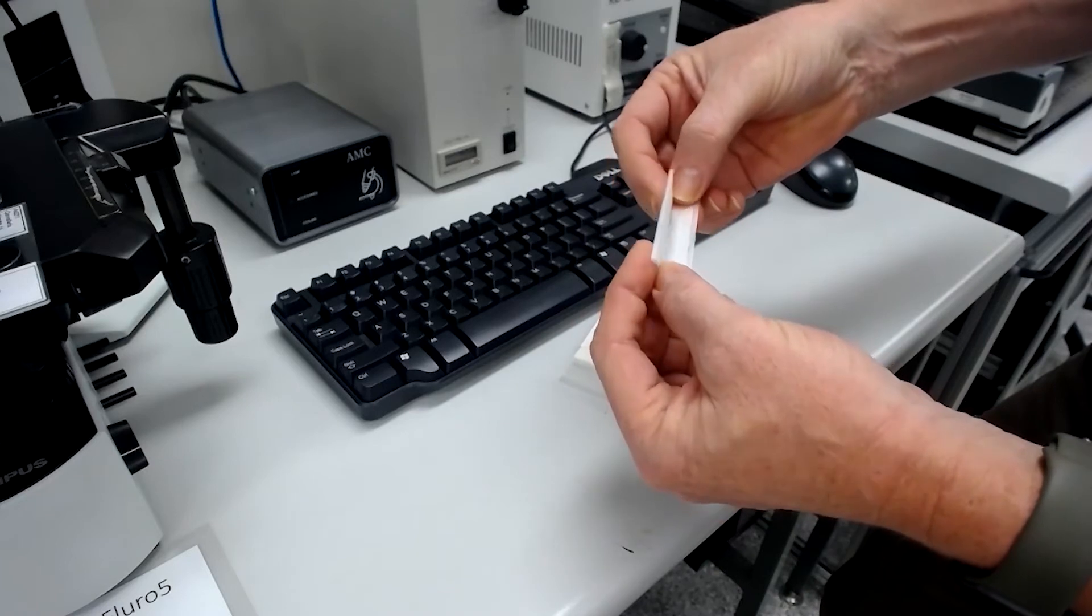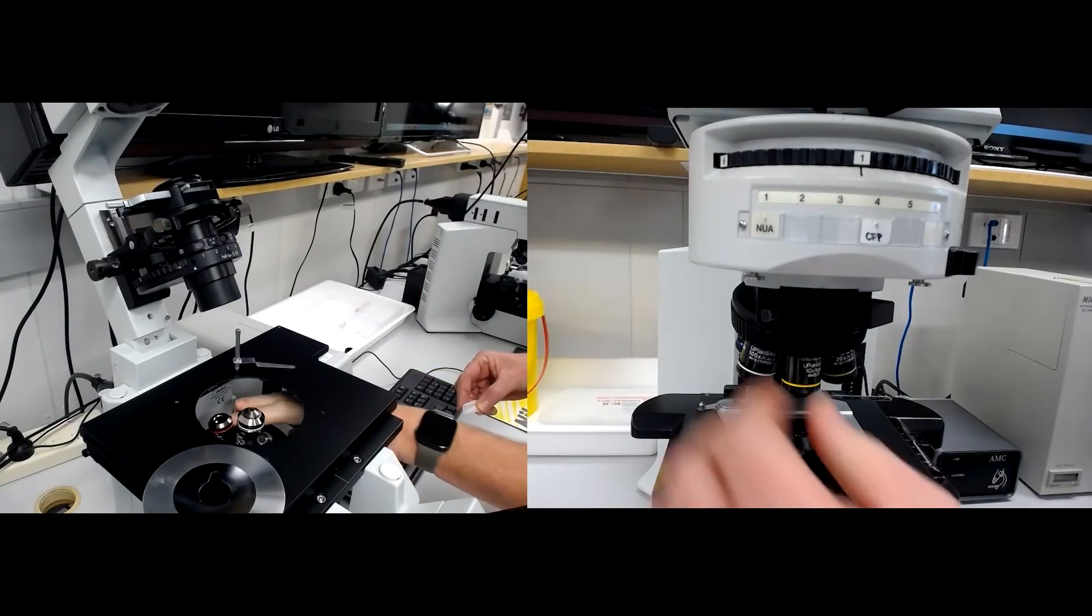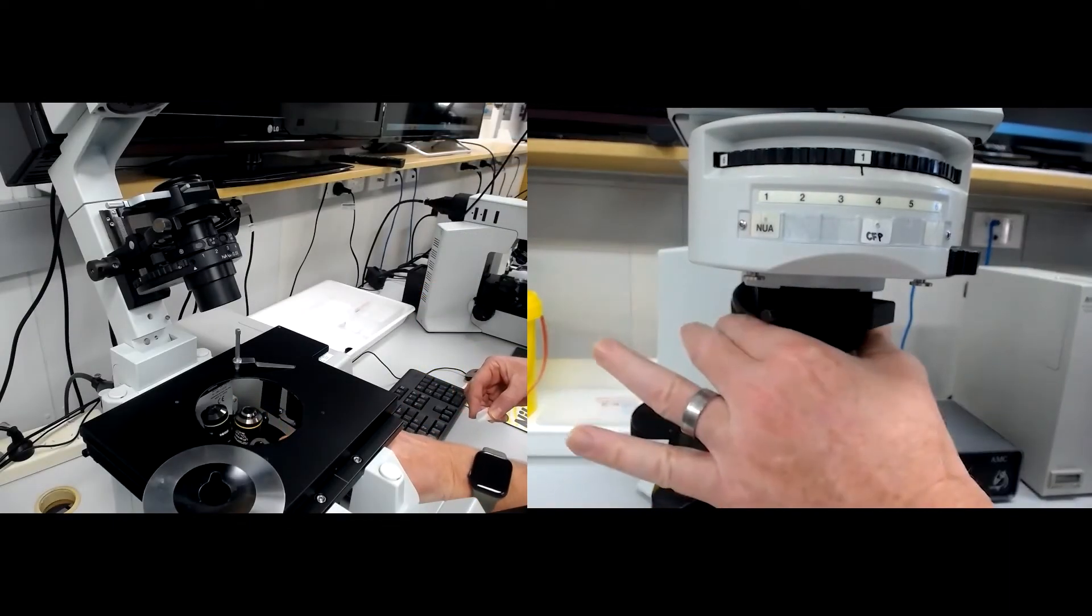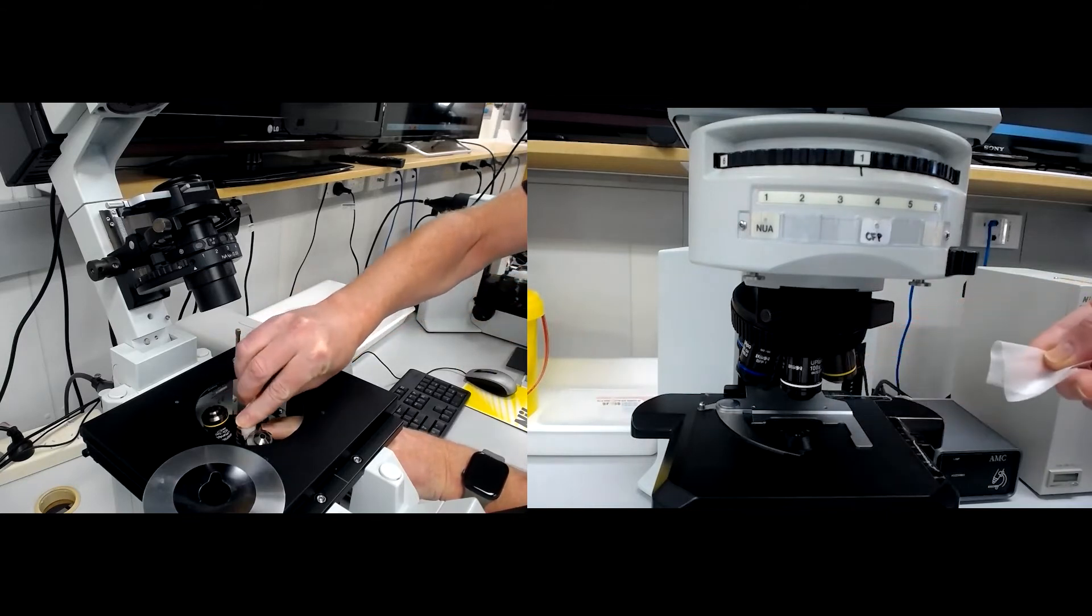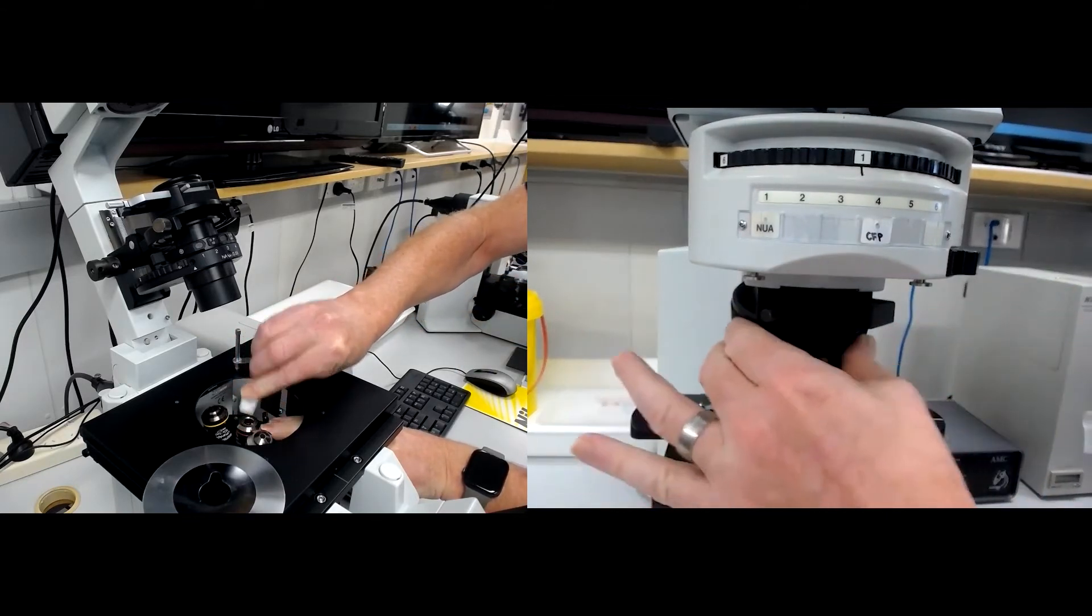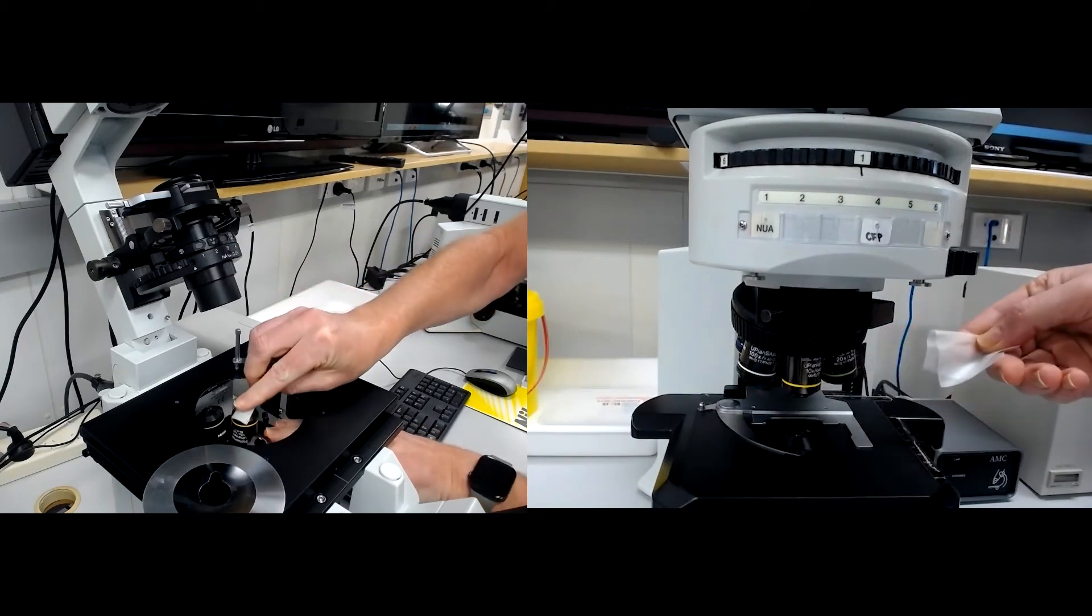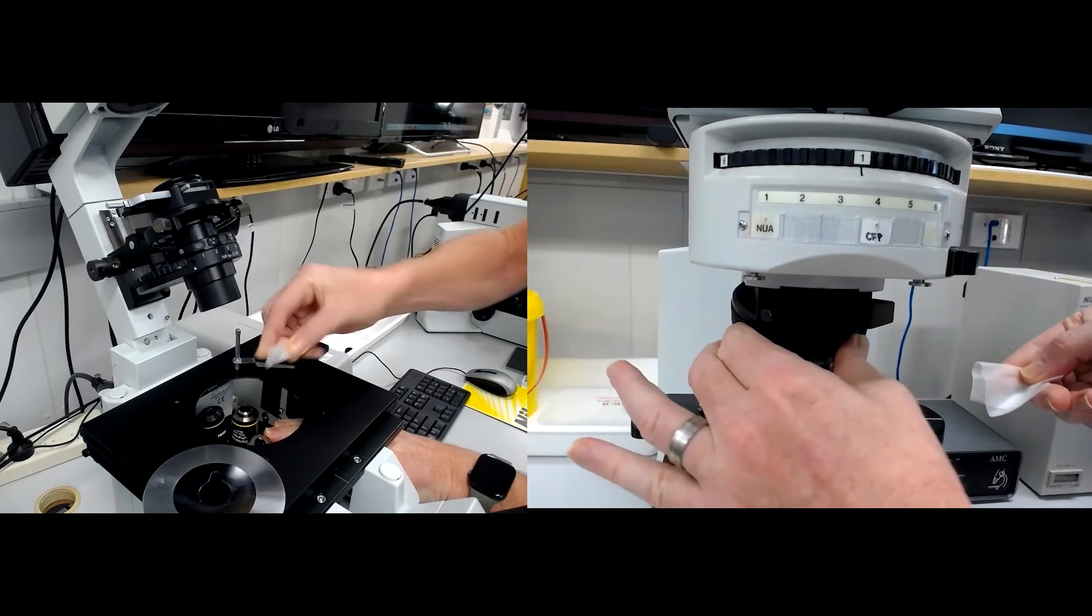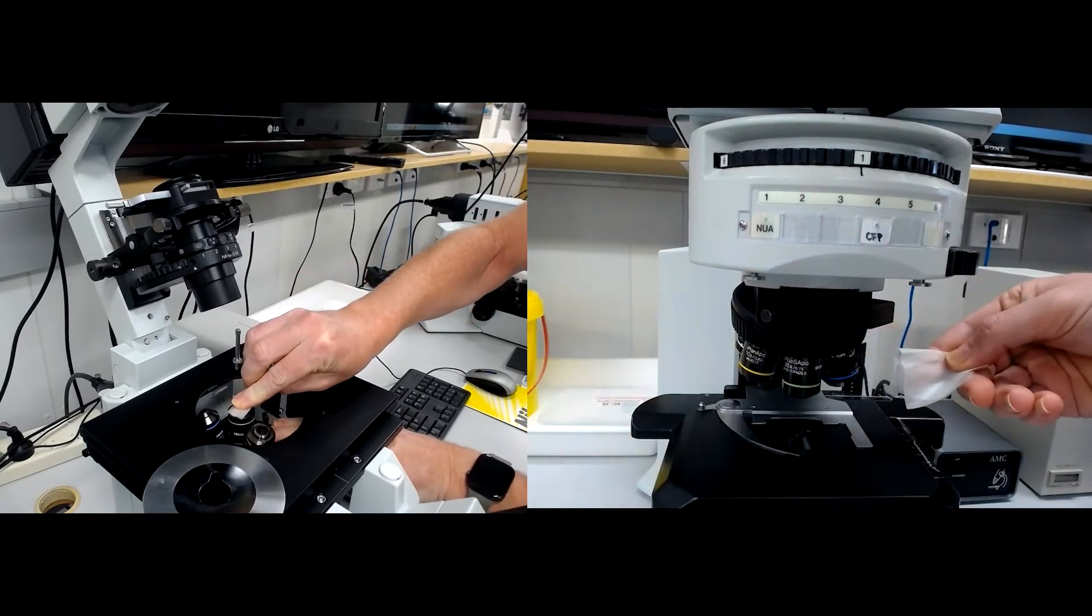Fold the tissue in half, then fold it in half again. Turn the turret so the objective is accessible on the side and push gently to conform your finger to the lens. Wipe in one direction. It is important to not wipe back and forth as any dirt on the objective could potentially scratch the lens.